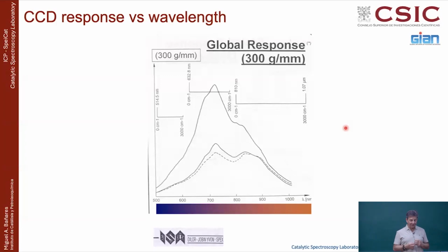And when you read the signal, the detector is a CCD like the telephones, better quality, refrigerated, and so on, but it's basically a CCD detector, what we use in spectroscopy. The response of a CCD detector is not linear with the wavelength. It is much more sensitive to a given color. In particular, a typical CCD response is like this.